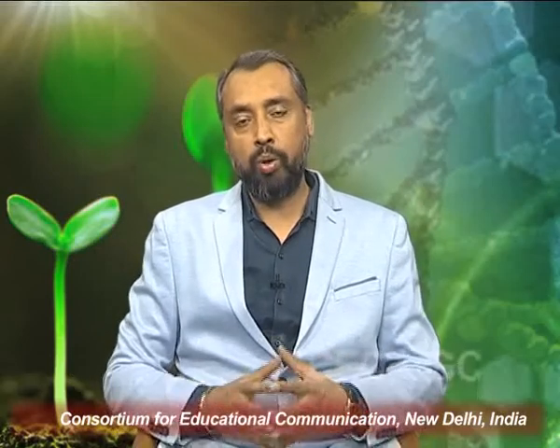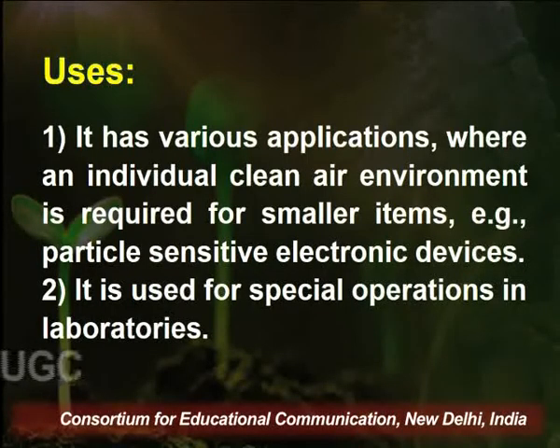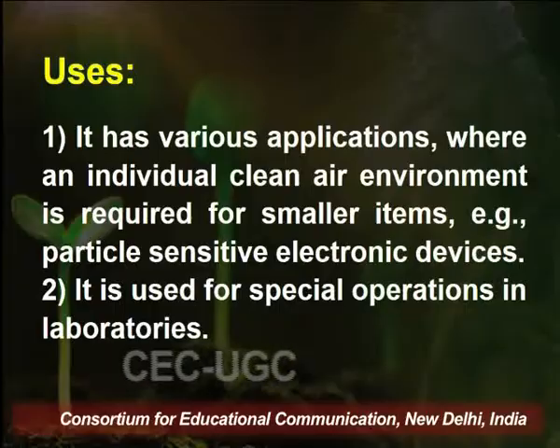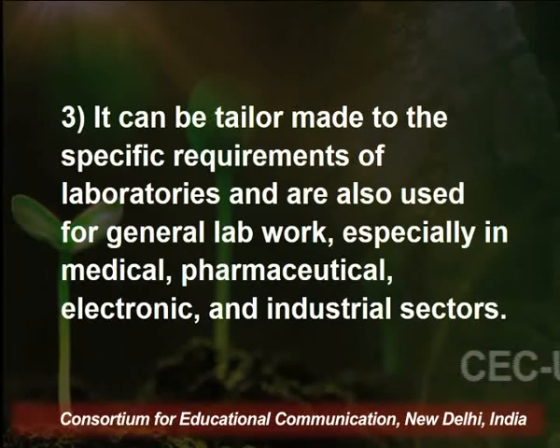So what are the various uses of laminar flow? It can be used where an individual clean air environment is required for smaller items, for example, particle sensitive electronic devices. It is used for special operations in laboratories also. It can be tailor-made to the specific requirements of laboratories and is also used for general lab work, especially in medical, pharmaceutical, electronic and industrial sectors.